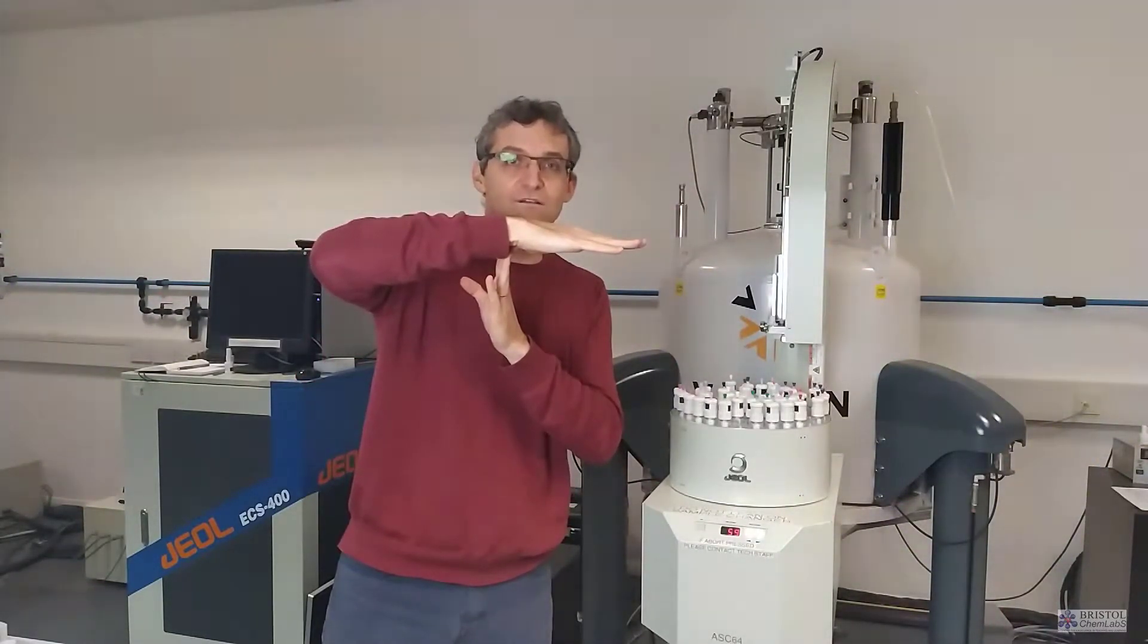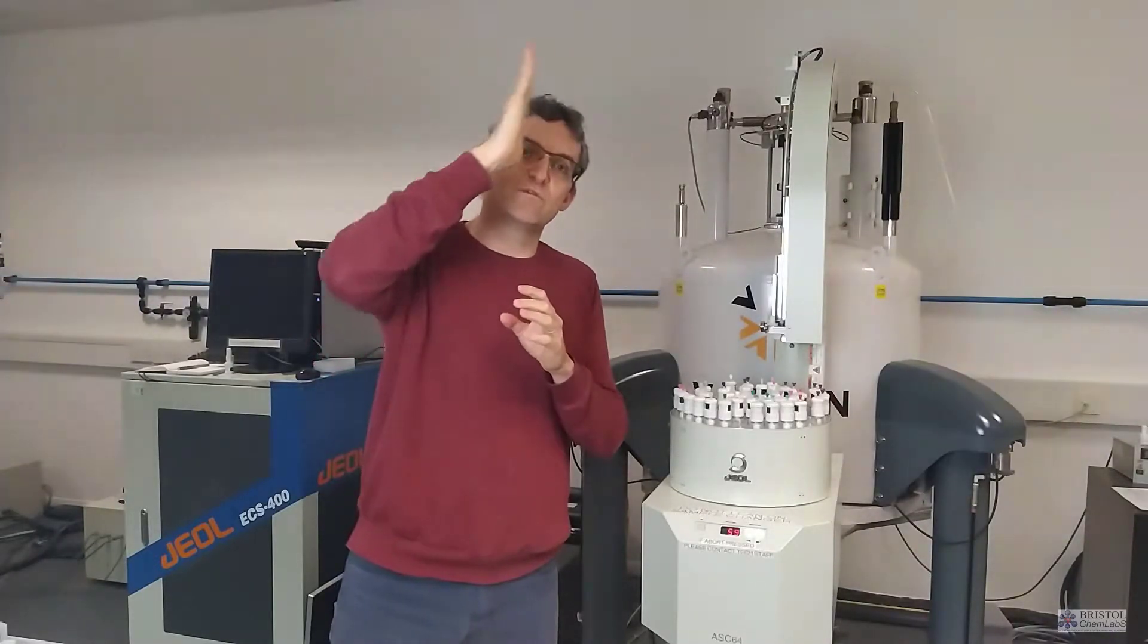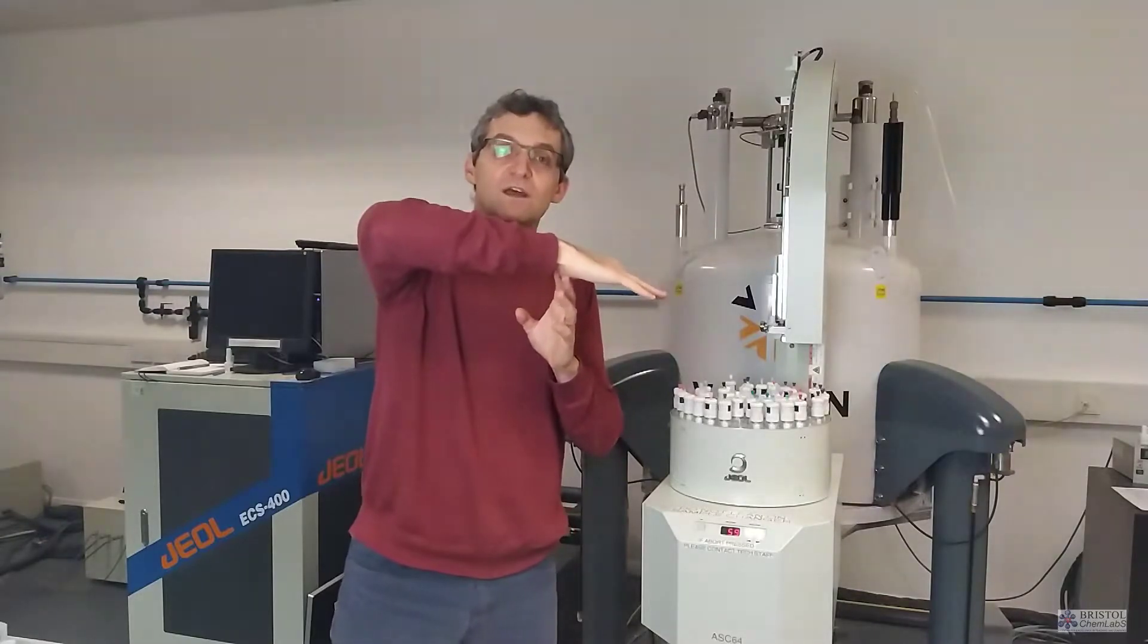In NMR spectroscopy, all we do is smack the hydrogen nuclei with radio frequency pulses, knock them out of alignment with the magnetic field, and then we listen to the signal as they relax and align back up with the field. We're putting them into a very high energy state, out of alignment with the field, and then they relax back into alignment with the magnetic field and release that energy. And we measure that energy as it gets released.